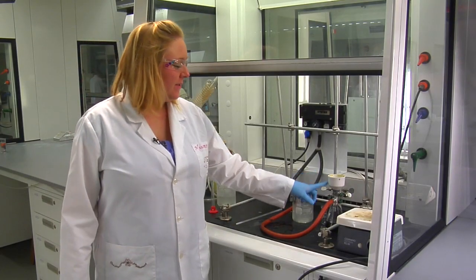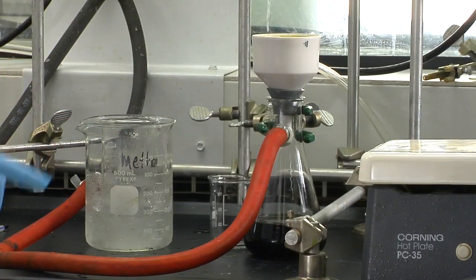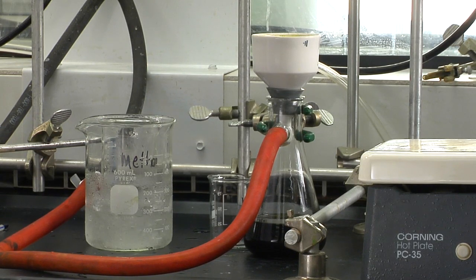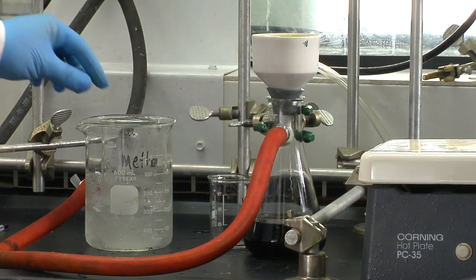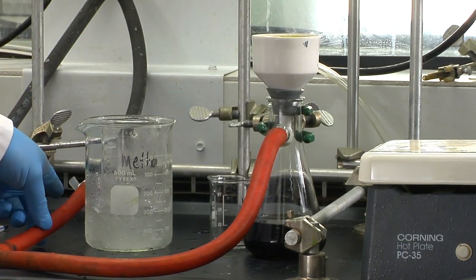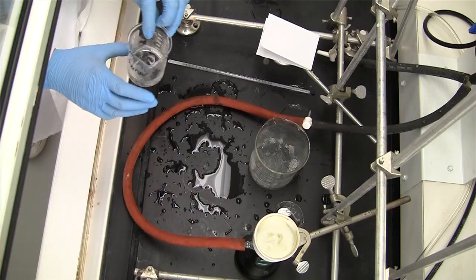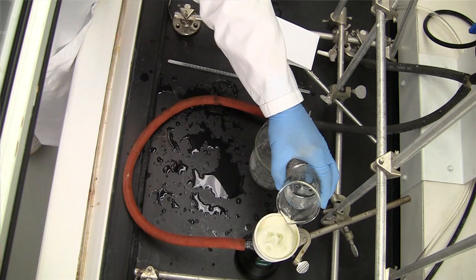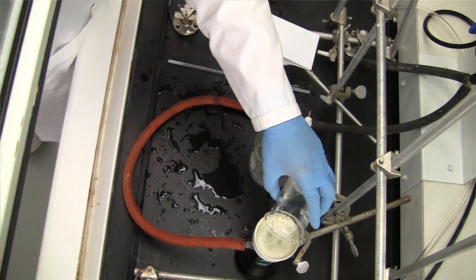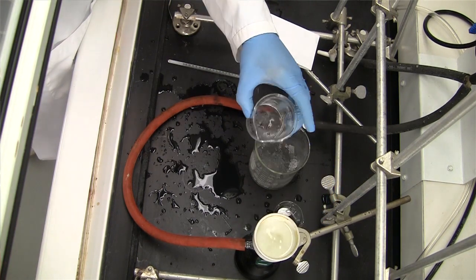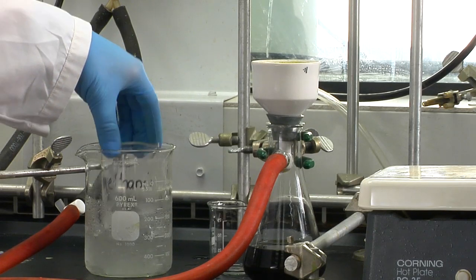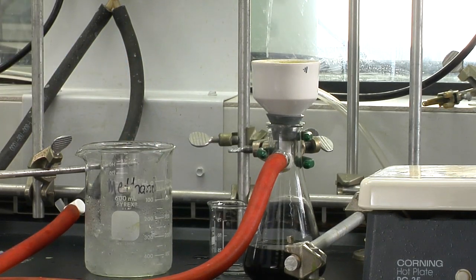Once you've filtered off the liquid from your solution, we're going to wash with some chilled methanol. Stop the suction by turning the stopcock valve and add 10 mils of your chilled methanol. Let this stand for a few minutes before reapplying suction.